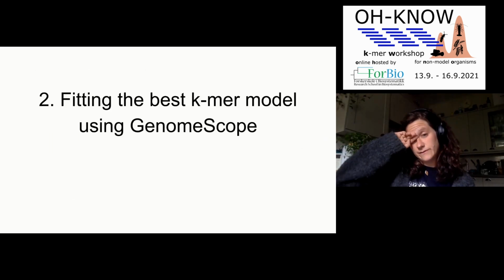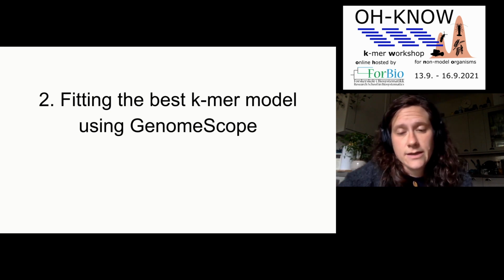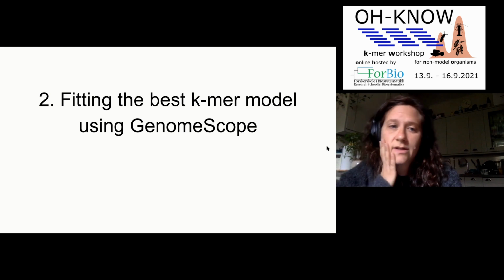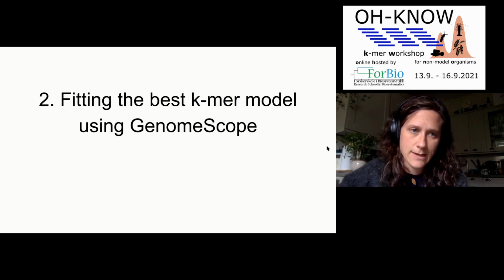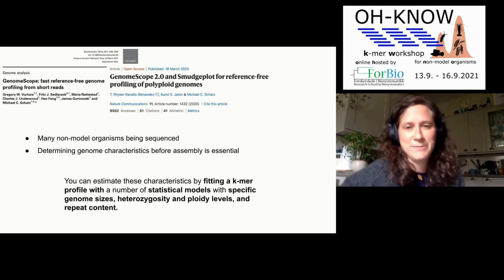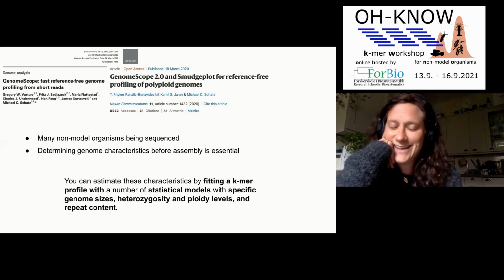Okay, so the second part of today's blog is how we can use GenomeScope to fit best Kmer models. Probably the right person to talk about GenomeScope will be Kamil, but he kindly handed this to me.